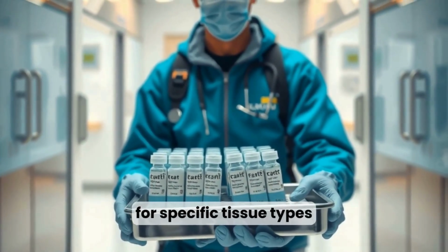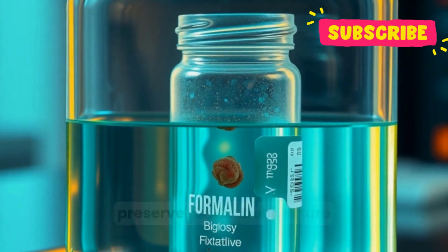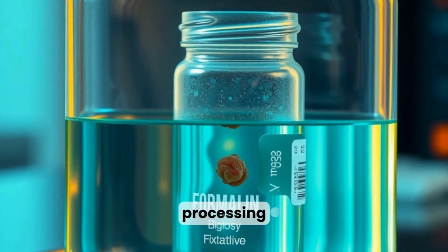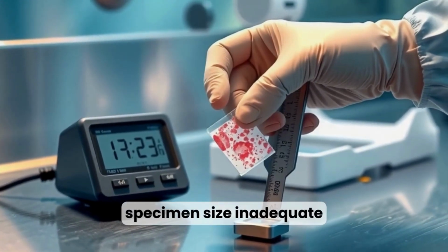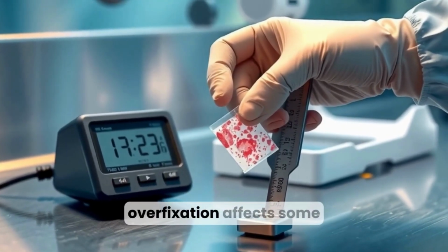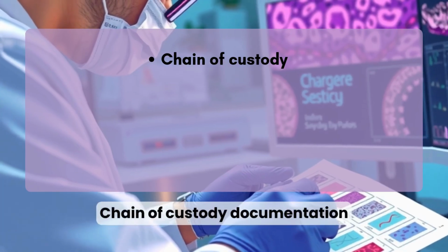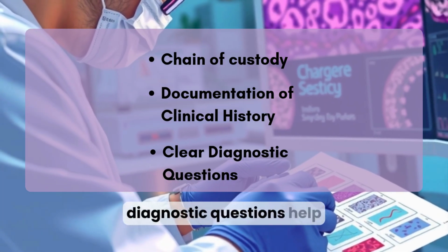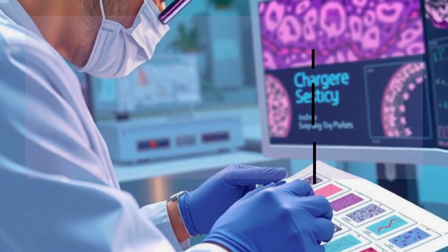specific tissue types. Most specimens are fixed in neutral buffered formalin to preserve tissue architecture and prevent autolysis before processing. Fixation time depends on specimen size. Inadequate fixation can compromise diagnostic detail, while overfixation affects some molecular tests. Chain of custody, documentation of clinical history, and clear diagnostic questions help prioritize the work and guide processing choices.